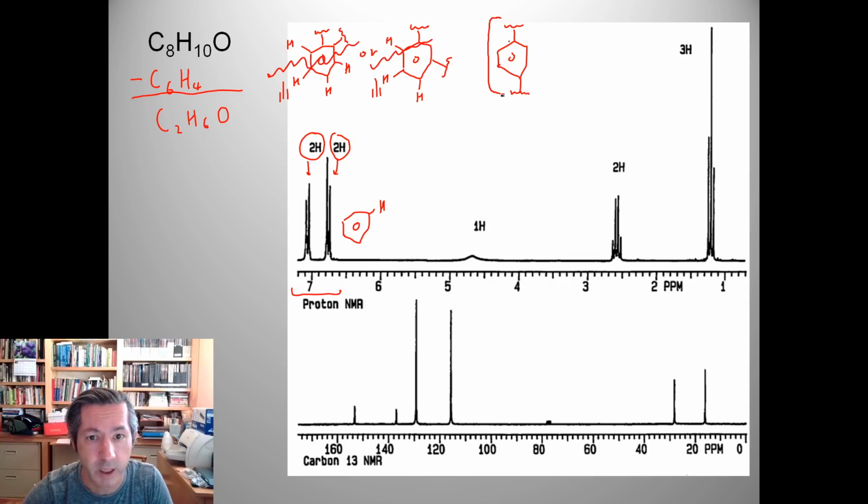This is one of our puzzle pieces here. This is a 1,4-disubstituted aromatic ring. And a typical giveaway for that, if you have 2 groups that are very different on there, is you're going to find that you'll have a pair of symmetrical doublets. And one thing I want to also point out, these guys are leaning towards each other. Notice the inner peaks are a little bit taller. When peaks are coupled to each other, they tend to lean towards each other. Another little piece of information there.